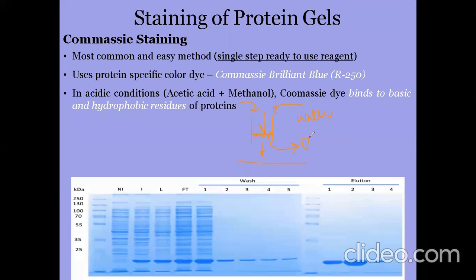So अगर हमें pure DNA चाहिए, so we can elute in that way. ठीक है, so we will get that, and if we run that on the gel, we will have a specific band. But this was for DNA, but I am talking about elution step. So elution is after purification, we can elute out the DNA from some solid support. ठीक है, समझ आ गई, क्लियर है? Yes, sir.